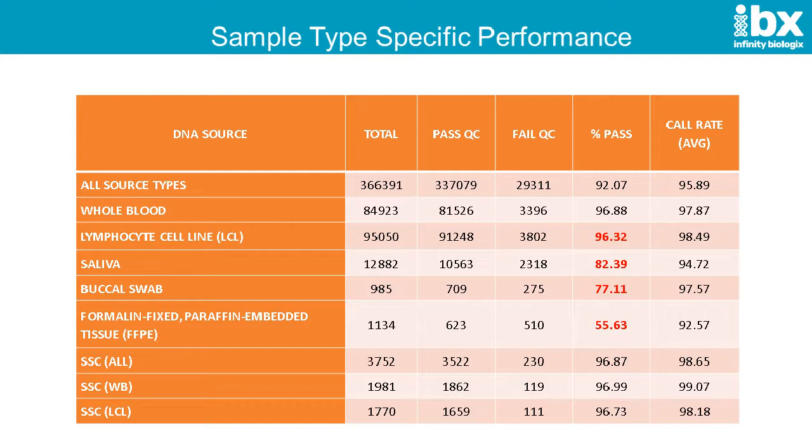So if you're looking at FFPE, the same way we look at quantitation using the Lunatic, the functional quality control is going to be a little bit different because this DNA is all chopped up and degraded for the most part or cross-linked. So the point of this slide is to demonstrate that it's not the overall pass or fail rate of a sample, but you need to understand this from the analytical QC side and the functional QC side to compare within a sample class, to know that the overall quality of your samples within a sample class or biomaterial type is reproducible.